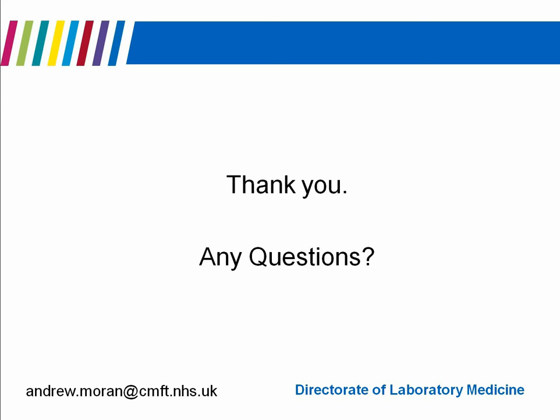Secondly, I want your expert opinion on two issues quickly. First of all, do you think that staff in flow cytometry should be permanently placed in the flow cytometry section, treating it as a specialist section? And secondly, do you think that flow cytometry should be part of hematology rather than immunology? I'm only here to talk about competency. The other issues there.